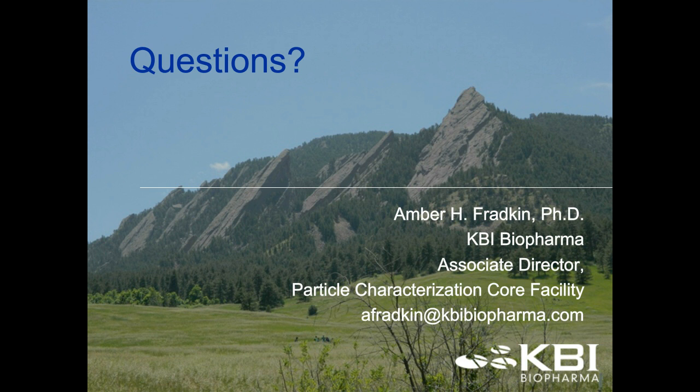Other than that, if we're looking at, say, density of protein particles or other larger particles, we can gauge that based on intensities, actually. So the more dense those particles are, the darker they actually appear in the image. But you've got to be careful there, because a lot of those intensities will actually rely on the refractive index of the solution that protein is in. So understanding those caveats with the instrument will help you interpret that data a little better.